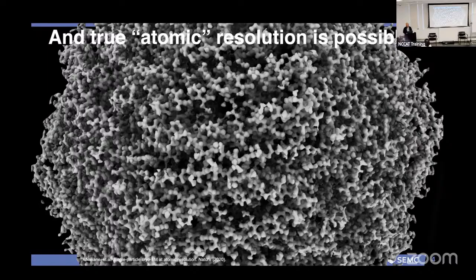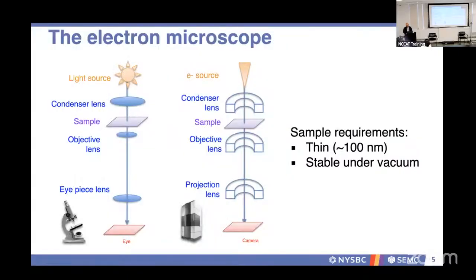What can happen during the way that we image a sample is that we forget all the steps that are upstream and downstream. And a lot of what's being done in sample preparation won't be fully realized until several different steps downstream.